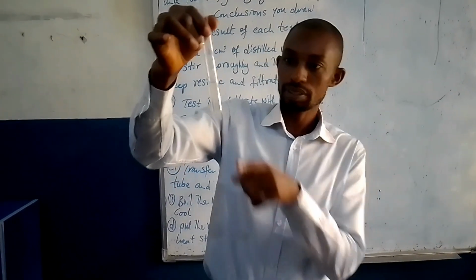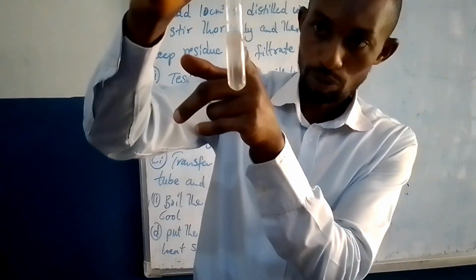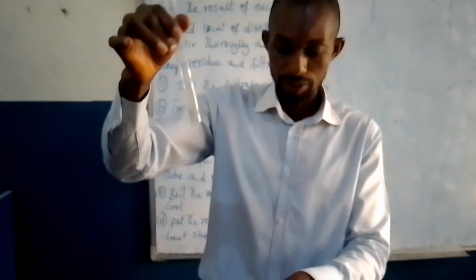I believe that the residue you are seeing on top is a result of the weakness of the filter paper.